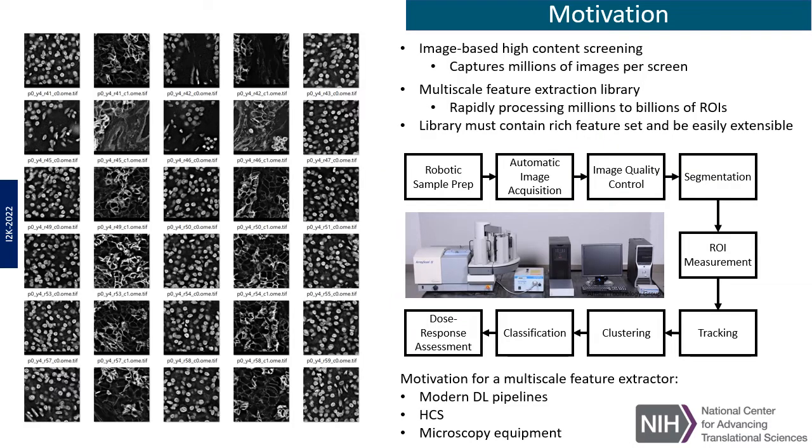So the motivation for developments in the field of feature extraction is progress in microscopy techniques. Recent achievements in confocal and fluorescent microscopy and data acquisition equipment let us acquire a massive amount of cell images of very high resolution. An example image matrix is on the left.